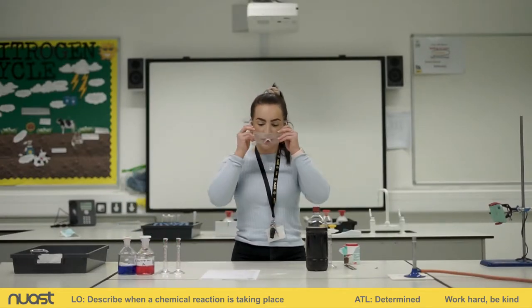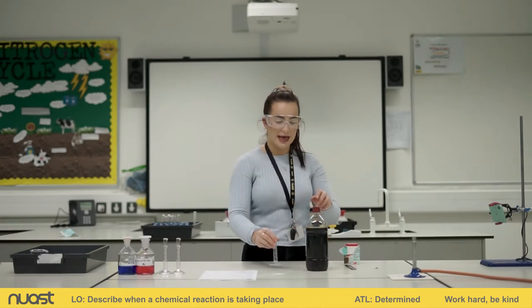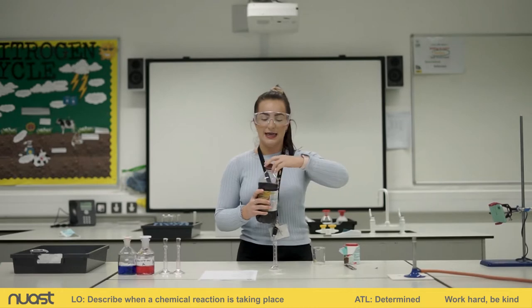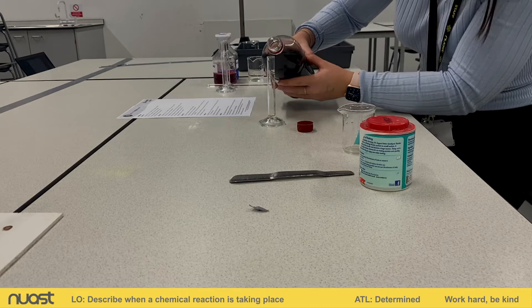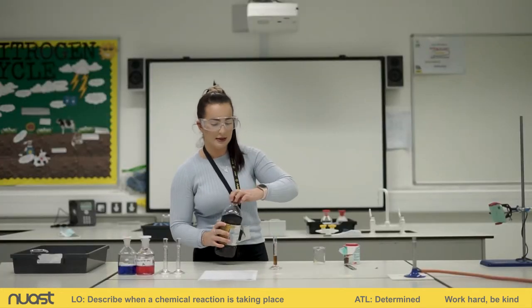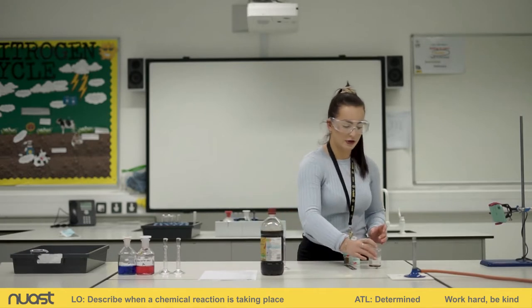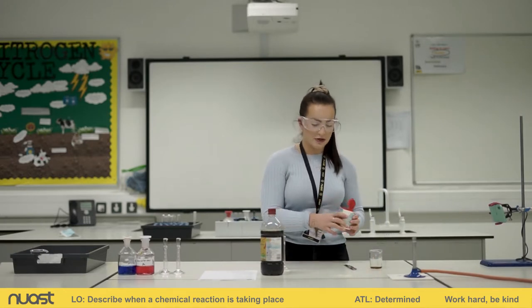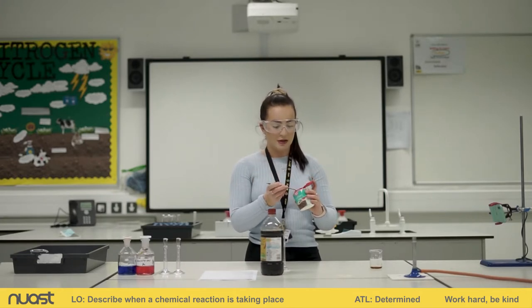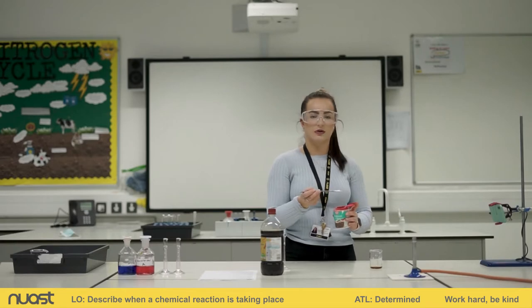We're going to start with station A now. I'm putting my goggles on. Step one is to measure out three centimetre cubed of vinegar using a measuring cylinder. This is just vinegar from the supermarket — everything we're actually using in station A can be bought from the supermarket. I've got my three centimetre cubed measured out and I'm going to add that into my small beaker. Then I've got to add a spatula of bicarbonate of soda — you might use this when you do baking at home. I'll hold this up to the camera so you can see exactly what happens.